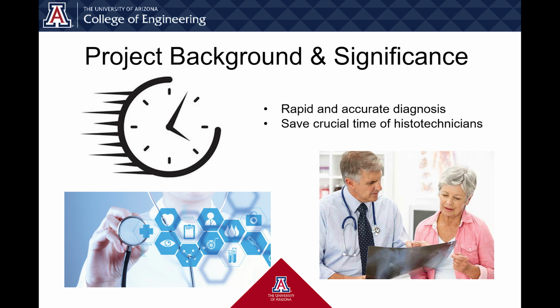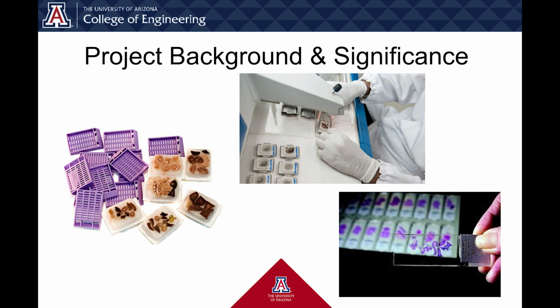Each minute spent handling these blocks is a minute away from analysis and diagnosis. In an environment where time is of the essence, efficiency isn't just beneficial, it's crucial. Timely patient care depends on swift and accurate test results. Delays in processing can increase anxiety and uncertainty for patients awaiting diagnosis.